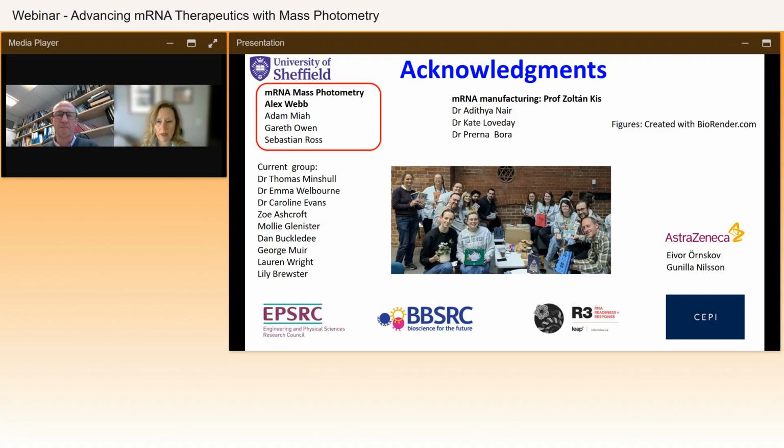Okay. All right, next question. Would IP RP HPLC followed by MP be a suitable method for detecting and quantifying alpha-synuclein in blood samples? It's a tricky question, probably outside of my remit, that one. It really depends on the concentration of that particular protein, etc. And that's a fair answer.